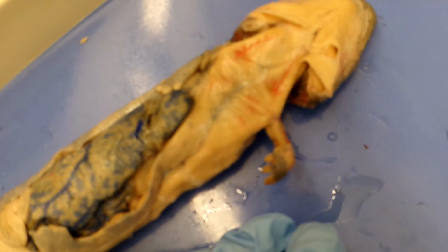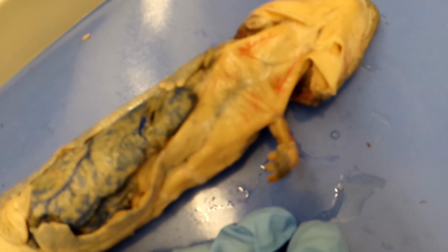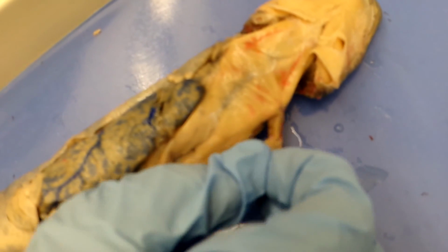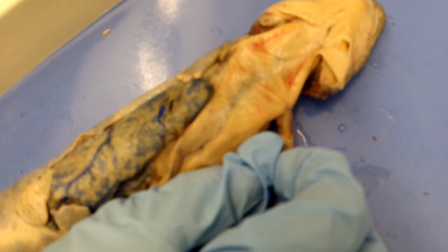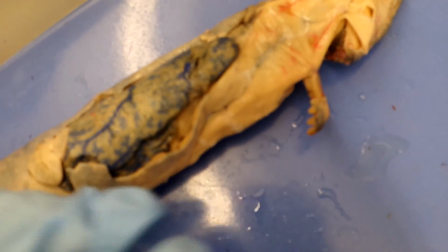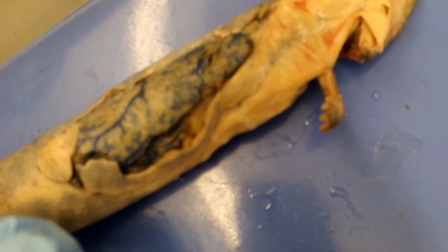And the last muscle in the Necturus is the extensors, which is also part of the fingers. Its origin and insertion is the dorsal antebrachium, and it is homologous to the abductors in the shark.